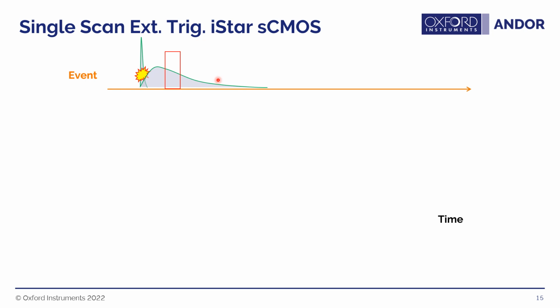And so from seeing this signal, we can see why we want very quick gated nanosecond timescale resolution, because there's this initial laser scatter that we do not want to measure. This is typically maybe picoseconds or 10 nanoseconds, whatever the time scale of the laser pulse is, approximately what the width of that scatter light might be. We don't want that to reach the camera sensor, but we do want to open the gate to allow this signal to reach the camera sensor.